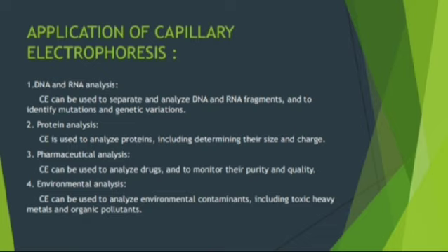In DNA and RNA analysis, capillary electrophoresis can be used to separate and analyze DNA and RNA fragments and to identify mutations and genetic variation. In protein analysis, capillary electrophoresis is used to analyze proteins, including determining their size and charge. In pharmaceutical analysis, capillary electrophoresis can be used to analyze drugs and to monitor their purity and quality.